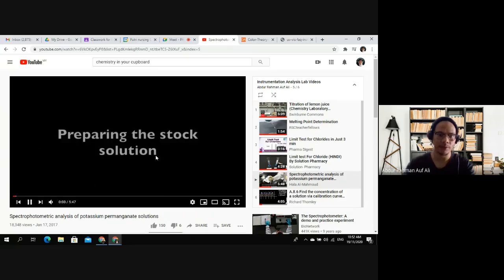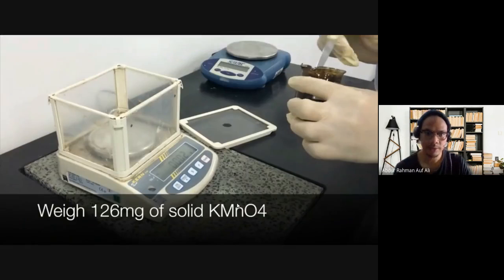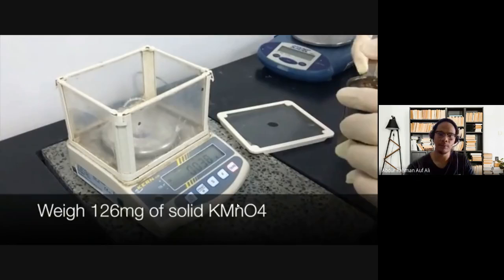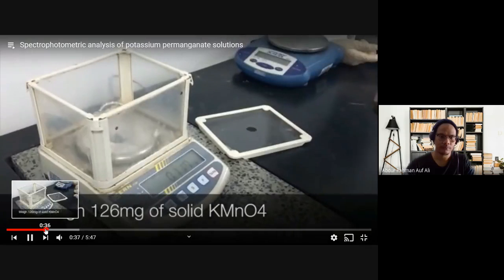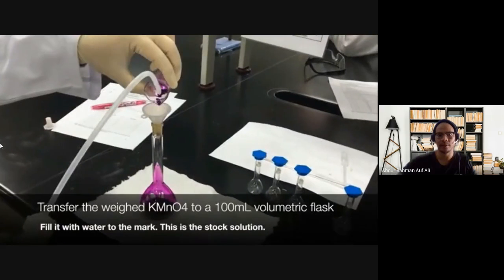Spectrophotometric analysis of potassium permanganate solution. So at first you need to prepare the stock solution. Stock solution is the milligram per 100 milliliter. So he uses his own method. He weighs 126 milligram of solid potassium permanganate. So this will take some time. Oh, my bad. So after he gets 126 mg of potassium permanganate, he will dissolve that in water.